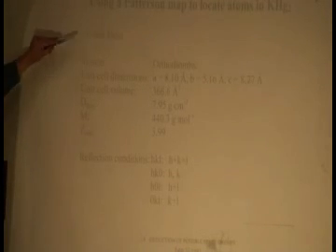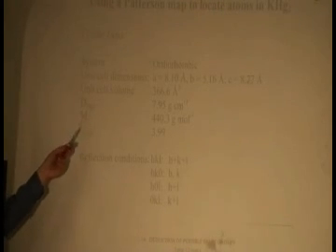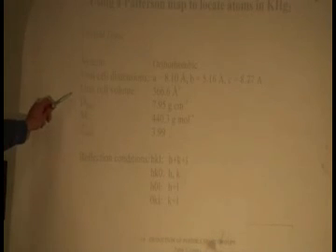What else do we have here? We have some crystal data, okay? It's an orthorhombic crystal system. Unit cell dimensions are given. Unit cell volume, approximate density. And they calculated a number of formula units per unit cell based on the experimental density actually.